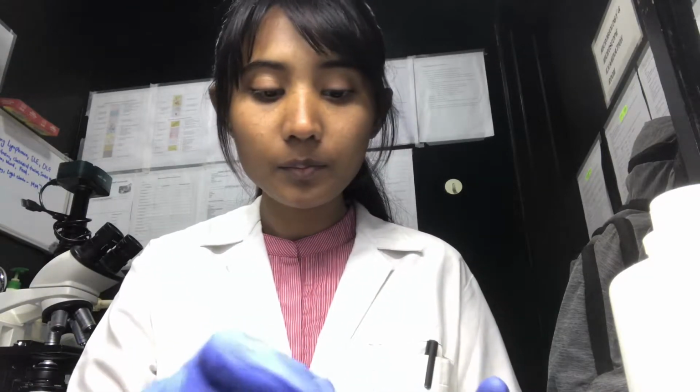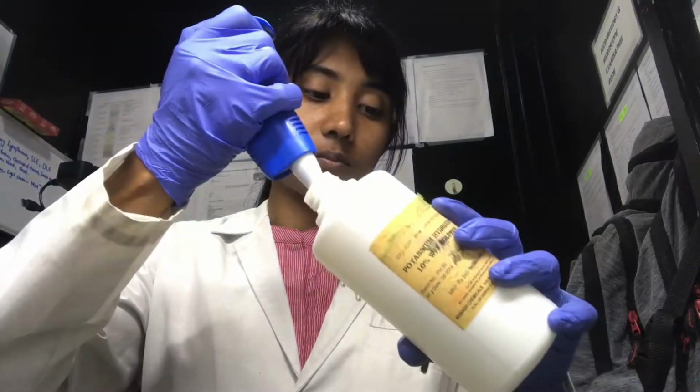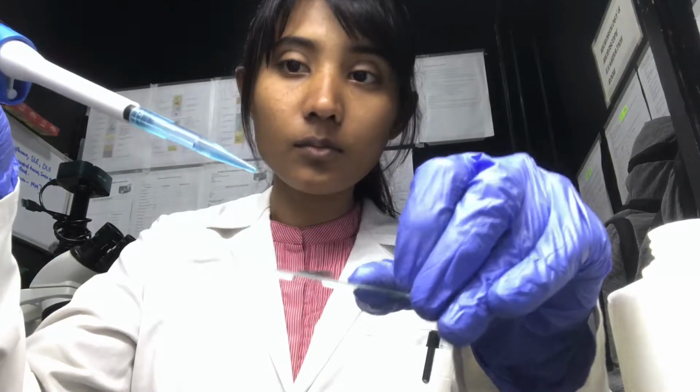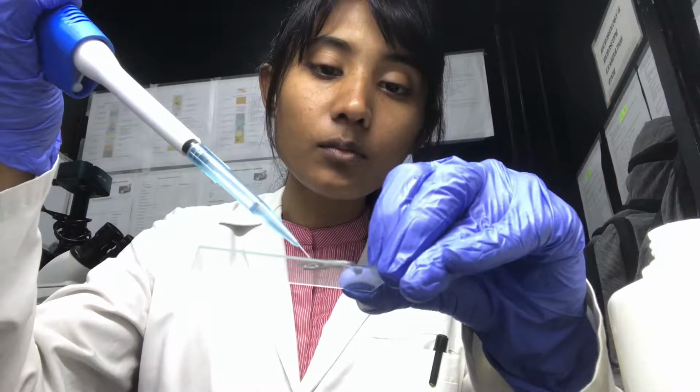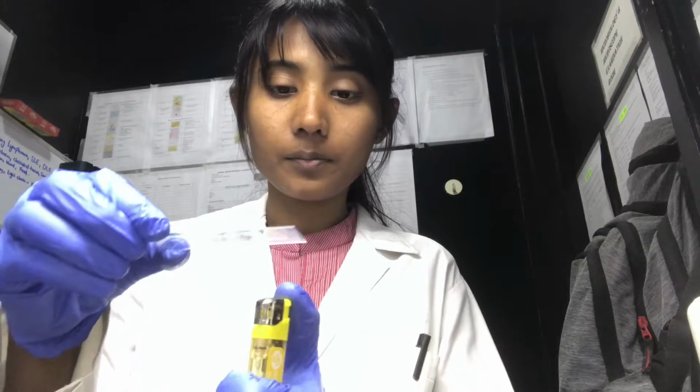So to begin with, keep the hair sample on the glass slide and add potassium hydroxide. Then heat the glass slide for 2 to 3 seconds.